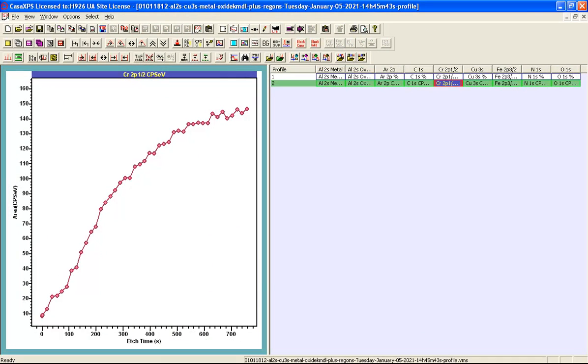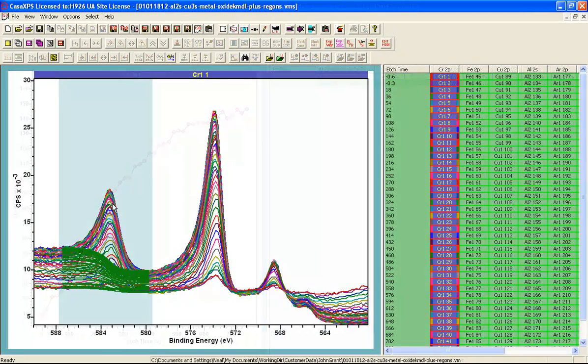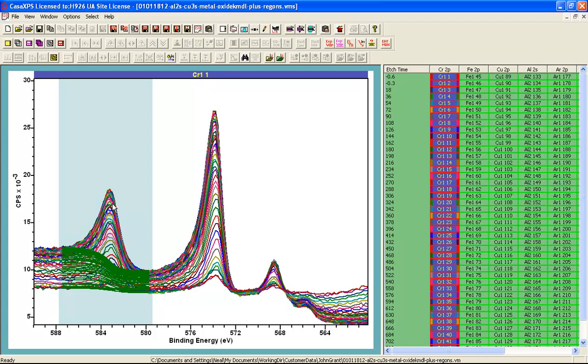This will be calibrated using RSFs so this will represent the amount of chromium at various points in this depth profile.